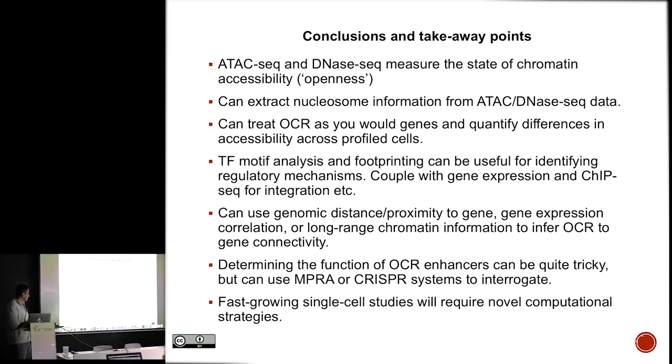And then, like I talked about, fast-growing single-cell studies are going to make things a little bit more complex as we deal with the technical limitations, right? Moving from a bulk measurement to a single-cell measurement, but it would be useful in looking at the resolution, right? So in terms of specificity, is an enhancer truly accessible in all cells that we think are the same? That's a very interesting question.